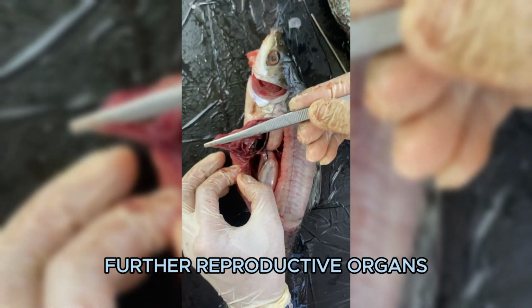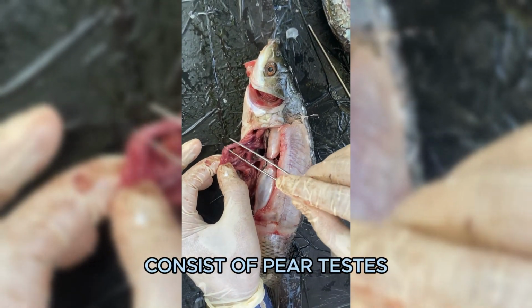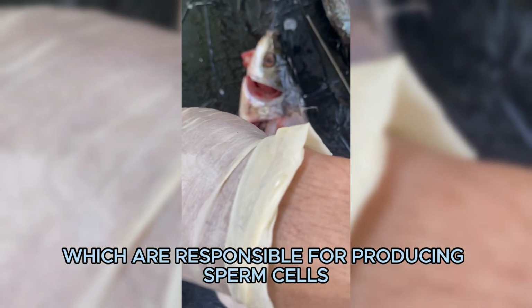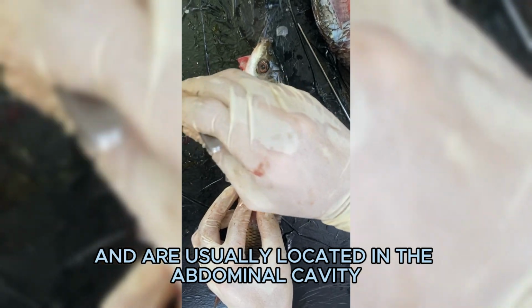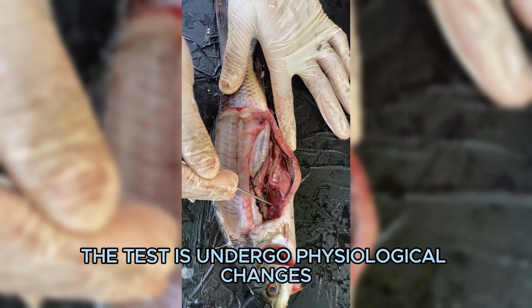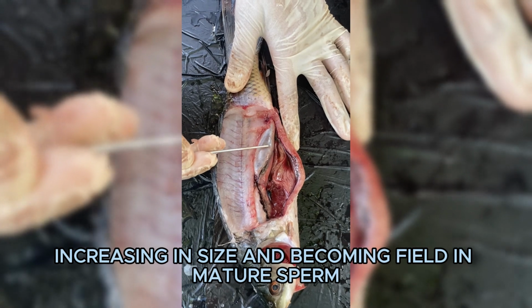For the reproductive organs in male carps, these consist of paired testes, which are responsible for producing sperm cells and are usually located in the abdominal cavity near the kidneys. During the spawning season, the testes undergo physiological changes, increasing in size and becoming filled with mature sperm.